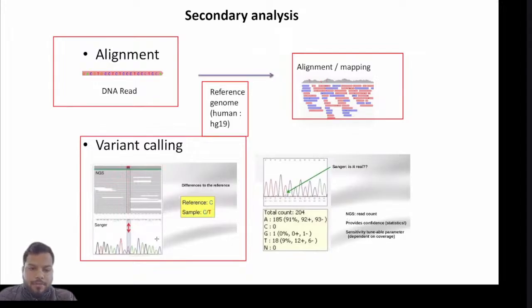We got different peaks which are one upon another in this chromatogram. So how will you decide? Suppose here is one example. You can get reads for two bases one upon another. Which has the maximum peak? We will go with the statistics. We will consider the peak which has more height than the other peak, and we will consider that this is the real base present there.